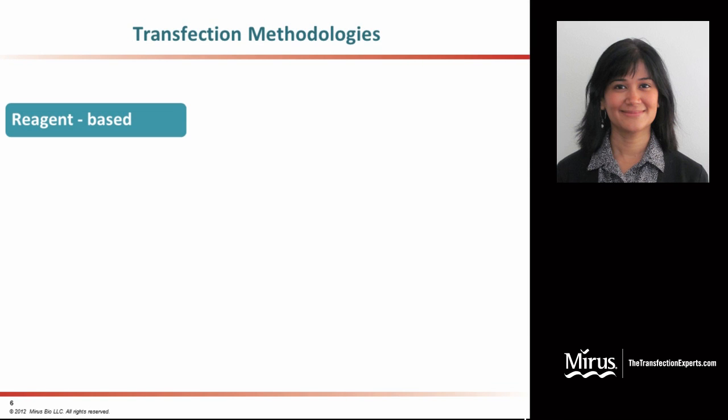There is a plethora of different transfection methodologies that are available for researchers currently. A majority of these are reagent-based methods that began with the use of calcium phosphate for condensing and complexing with DNA. However, this method, even though very cheap, suffers the caveat of being very irreproducible.